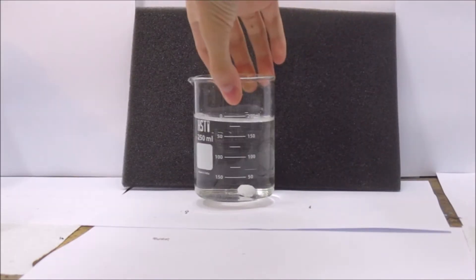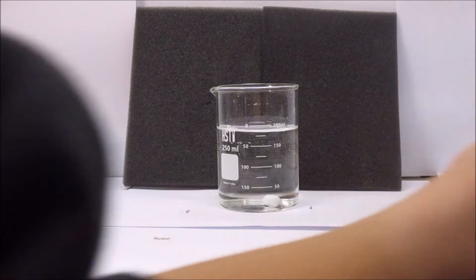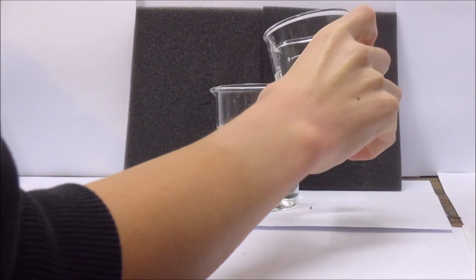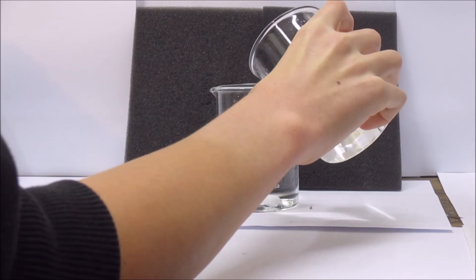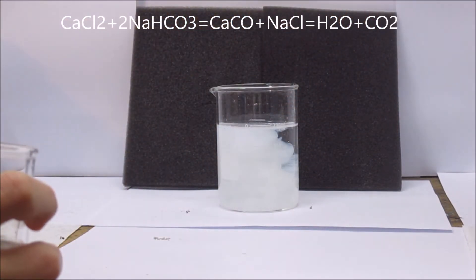I then added a black background and put the solution there. I then added the two solutions together. Immediately, the calcium carbonate precipitated out as a fine white solid.